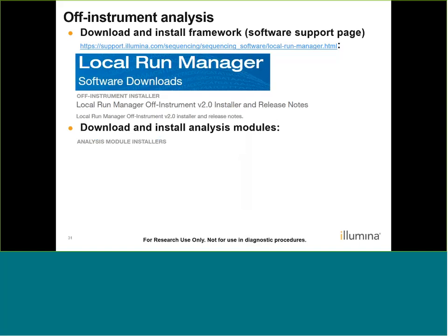Once the framework is installed, you'll still need to install analysis modules. The framework itself does not come bundled with any modules, which allows you to perform the modular installation of the workflows of your choice.